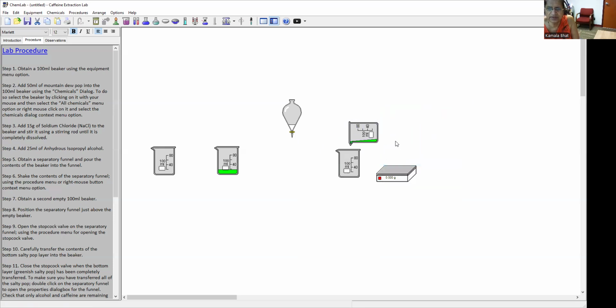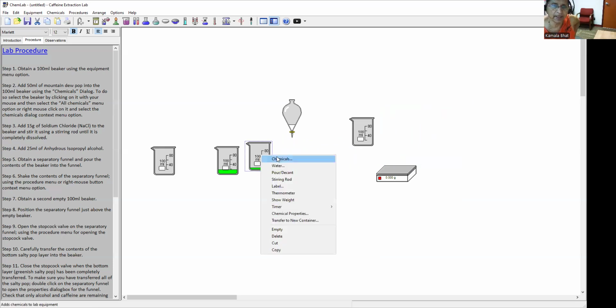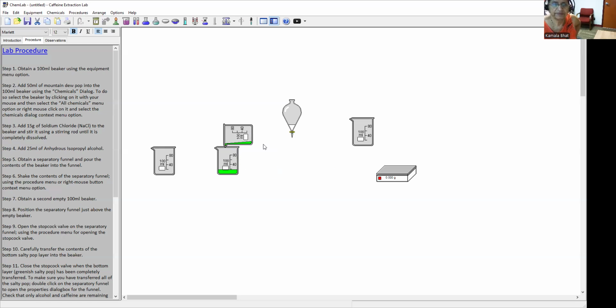You can see there is still some, oh, I don't know what happened. Oops, I know what I did wrong, so this should have gone back. Pour in the can. Now, into this, you drain out the stopcock so that you have only the alcohol left. So now you weigh the beaker.